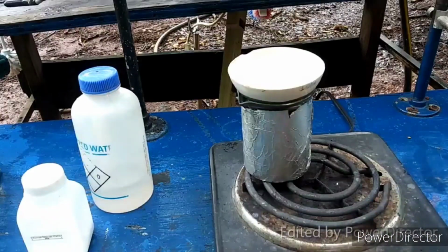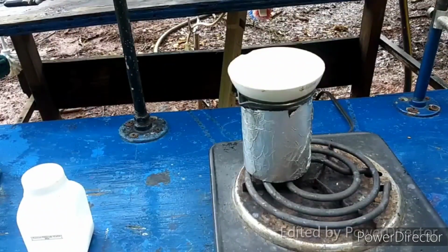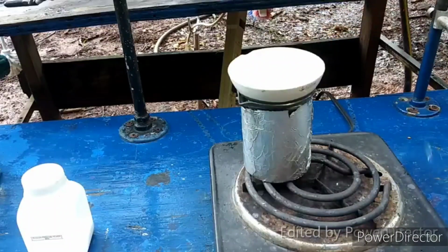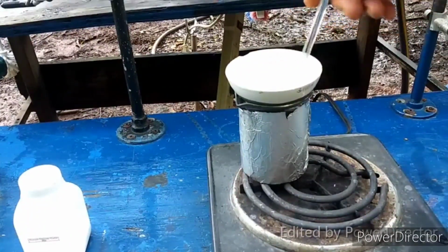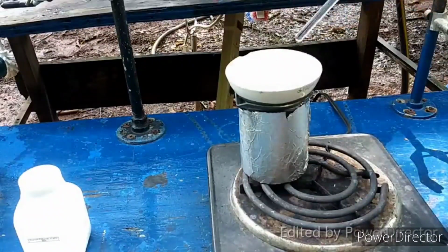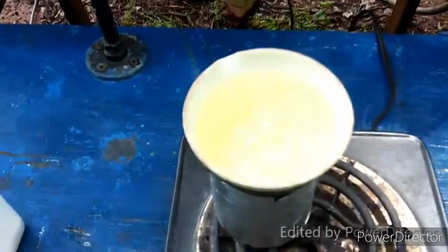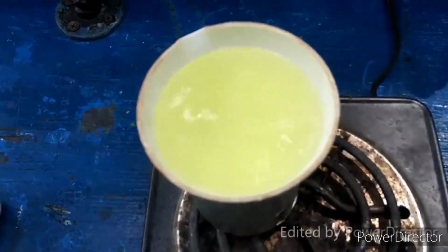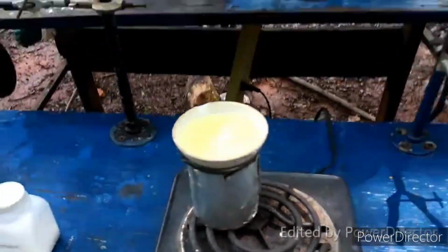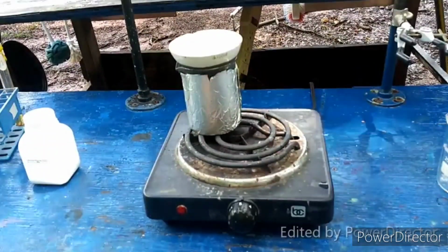Okay, there's our uranyl chloride, here's our cesium chloride. Let's give everything a little bit of a rinse. There we go. There's all of that. Give it all a stir. And there we go. Is that even showing up? Well, okay, yeah, now you can see it. I mean, there's not much to see. It's just a pale yellow clear solution. So now we're just going to let this evaporate down, and we should get our cesium uranyl chloride.